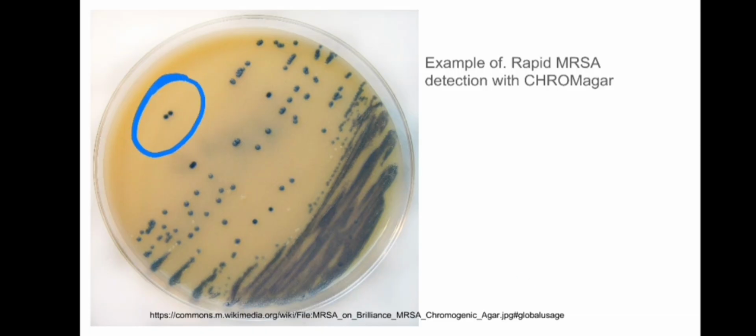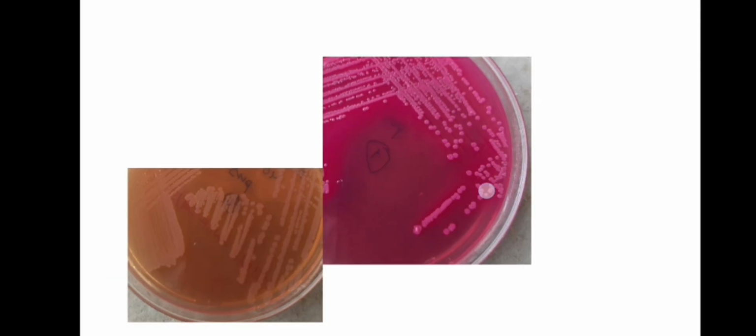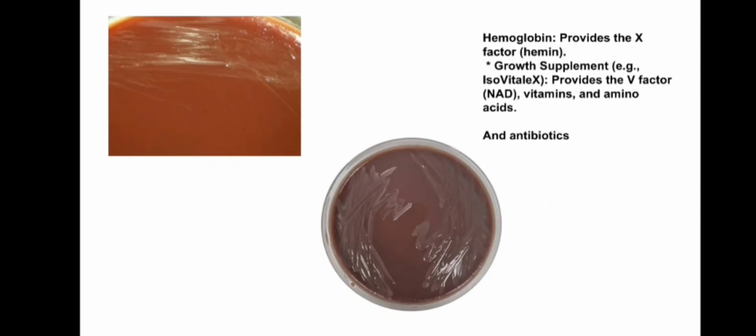Okay, you can see the colonies are spread out, and even here you can see clear-cut growth. But you can see another example. Yeah, this is another example. This is understandable because it is chocolate agar. Usually the growth is slow, so you can see this kind of pattern. Here there is moisture present. And this is not an issue, this is just undergrowth.